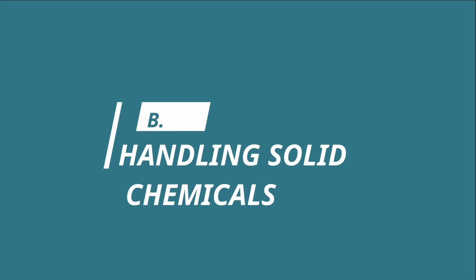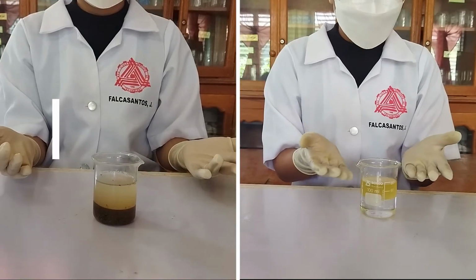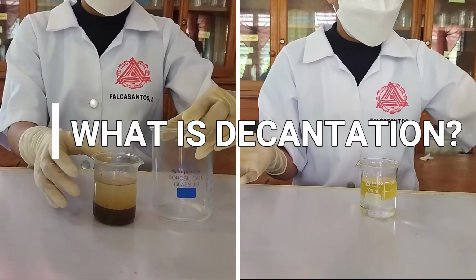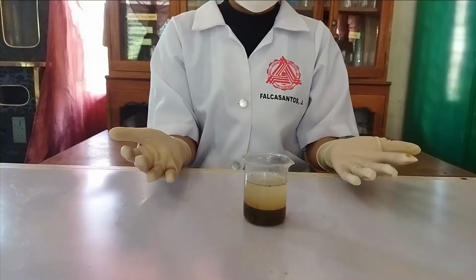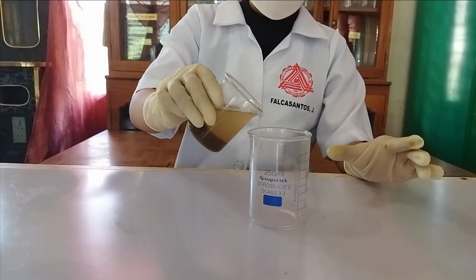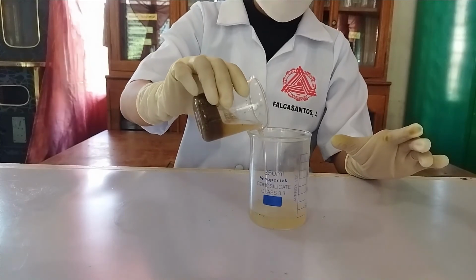Handling solid chemicals. Decantation. Decantation is a process involving the separation of liquids from solids and other immiscible liquids by removing the liquid layer at the top from the layer of solid or liquid below. You can decant the liquid by allowing the precipitate to settle at the bottom of the container. Tilt the container and slowly pour the liquid into the other container until no liquid is left.